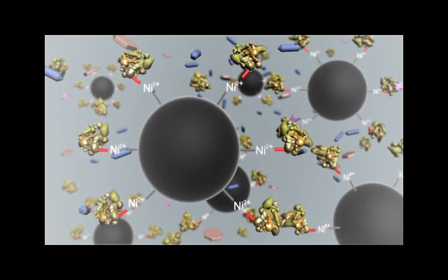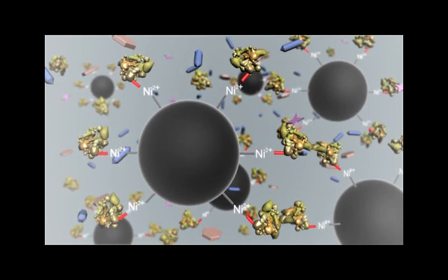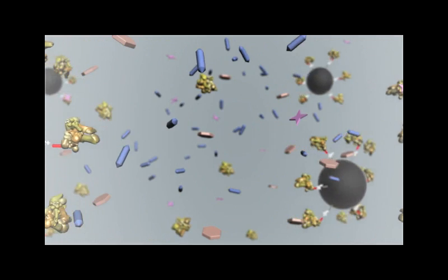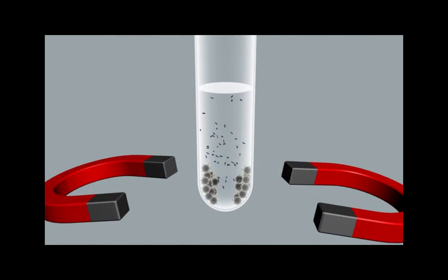Next, a magnetic field is applied which drives the magnetic beads to the sides of the well. The magnet is optimized to ensure the fastest clearing of the magnetic particles. The supernatant is then aspirated, removing impurities, and the beads are washed.